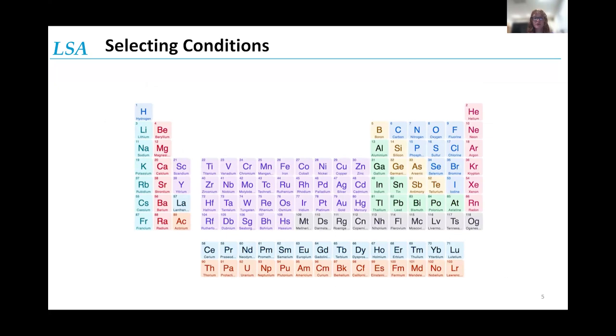With TOF SIMS, you collect all of the elements simultaneously. With magnetic sector SIMS, you have to select the elements you're interested in before you start the profile.